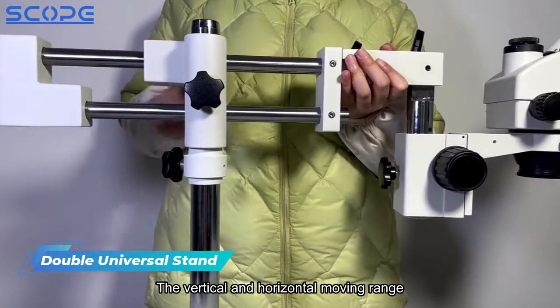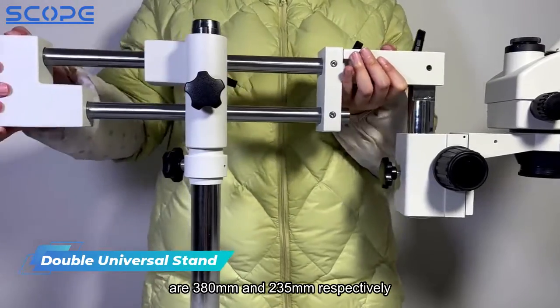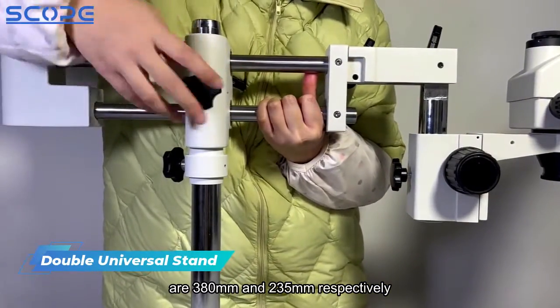The microscope can be adjusted to any viewing angle. The vertical and horizontal moving ranges are 380mm and 235mm respectively.